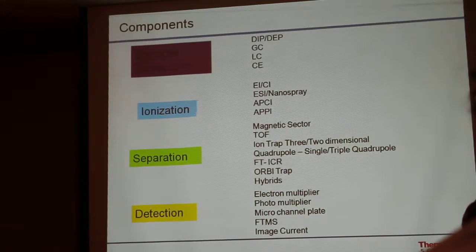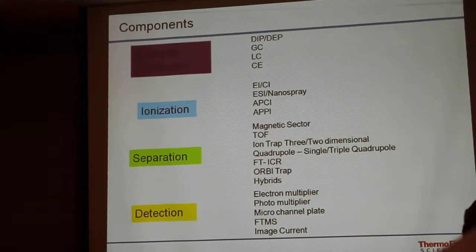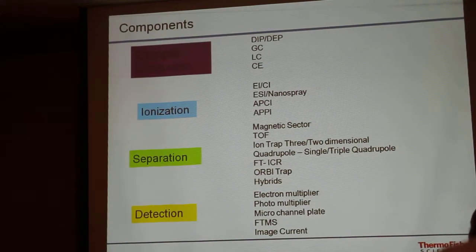You can separate components on an HPLC, take a component that's moderate polarity, it doesn't decompose very rapidly at high temperatures, put it in the direct probe, flash vaporize it into the mass spectrometer, and actually get molecular ions.